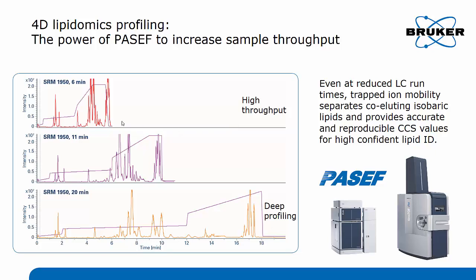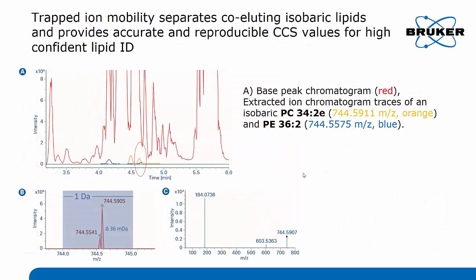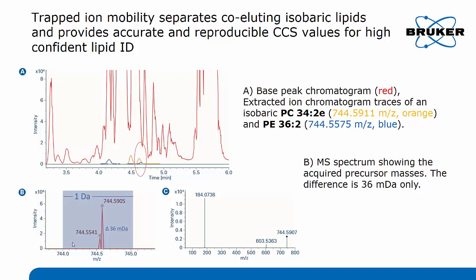Higher throughput means you have less time to separate the lipids on the chromatographic domain, and the challenge is that isobaric lipids can easily coelute. This is actually what we also found in our data when we decreased the analysis time to six minutes. You see in red the base peak chromatogram trace, and highlighted here are two extracted ion chromatograms of isobaric lipids.